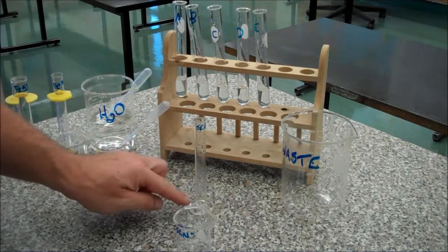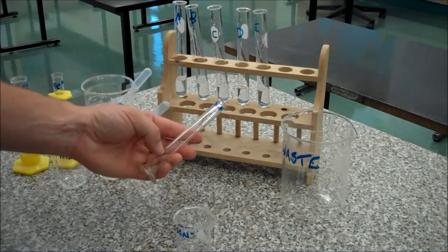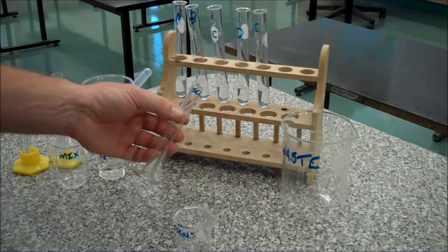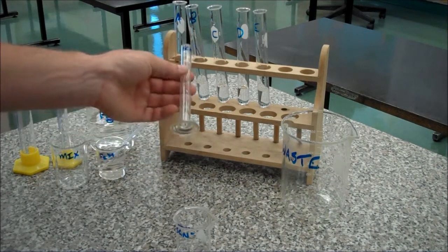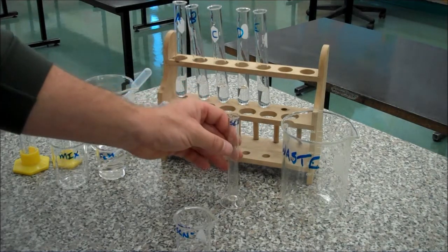The other thing that equilibrating the glassware does is it minimizes the amount of loss on transfer, because there were some drips or drops or whatever moisture from the equilibration step. So if you still have some after each 5ml transfer, well, you had some after the equilibration step as well, and so you've minimized the loss on transfer by equilibration.